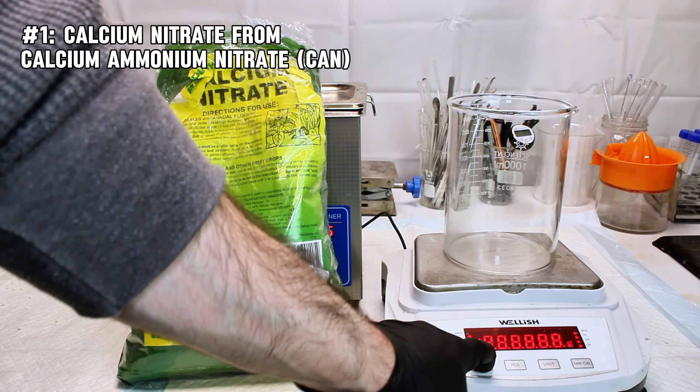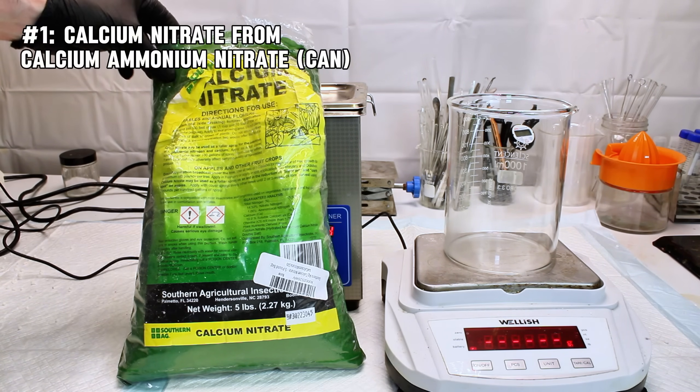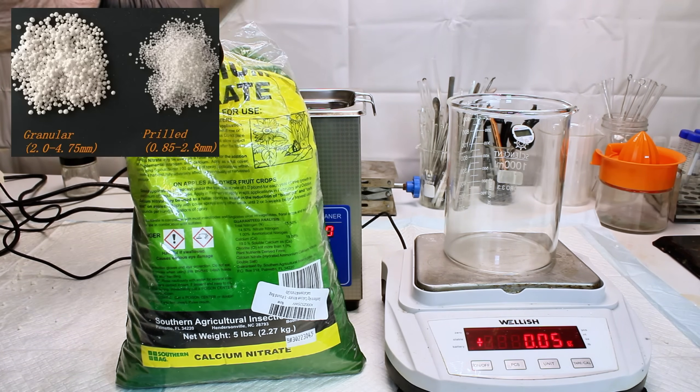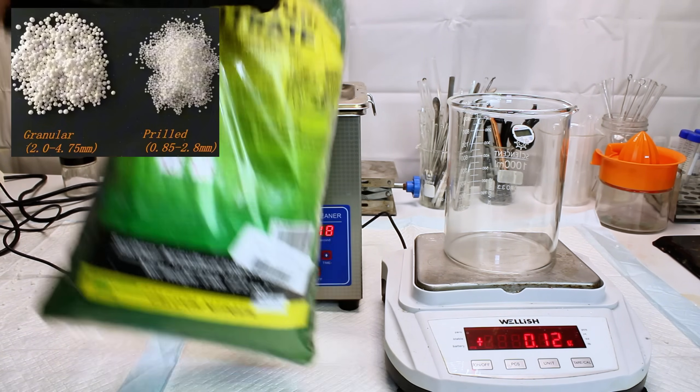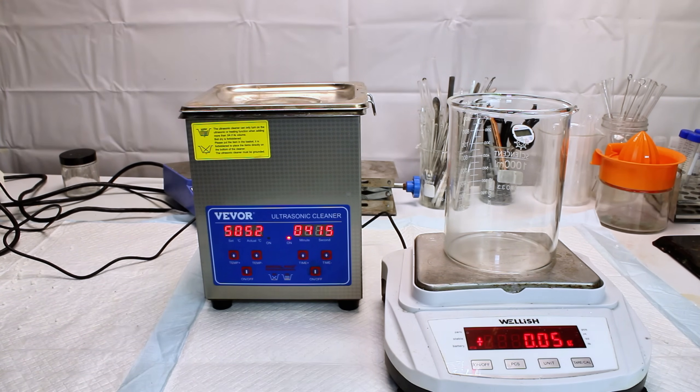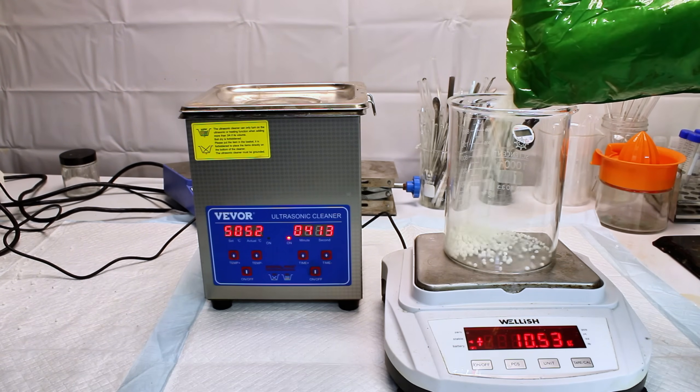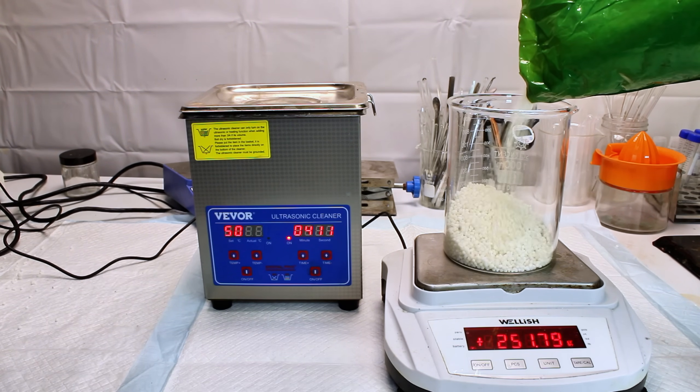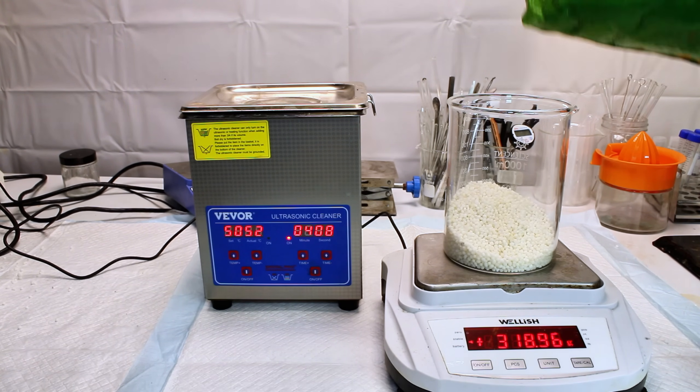First up I have some calcium nitrate, which like most fertilizer is sold as off-white granules called prills. The main issue with most fertilizers is that they're far too dirty for use as reagents. But this calcium nitrate has a second problem in that it isn't actually calcium nitrate.